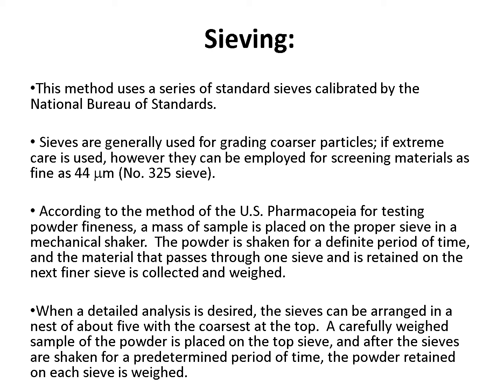This really is tedious, and you can measure really only 2 dimensions. So sieving is easier and the best.